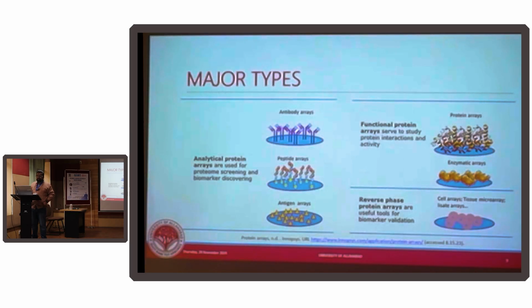Why don't you go for an enzymatic array, where you can have substrates, and each of these substrates is unique to the enzyme, and if the substrate reacts, it will create a chromogenic spot. And based on the presence or absence of the activity of the enzyme, your spots will change color, maybe from faint yellow to brilliant yellow. And these arrays can again be scanned and digitized, and once it is digitized, you have Professor Wall who will help you to apply his magic of AI and ML to understand your data better.